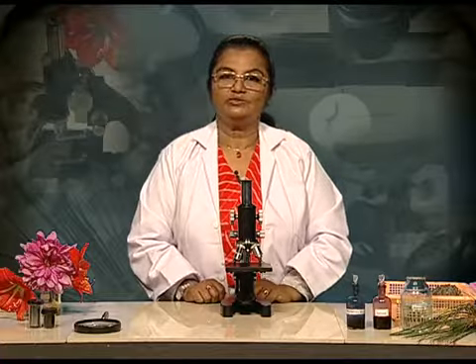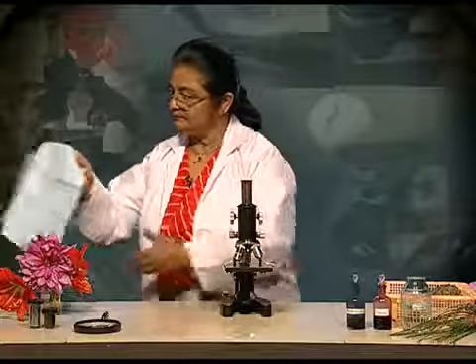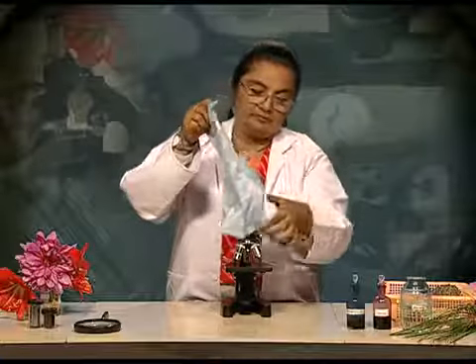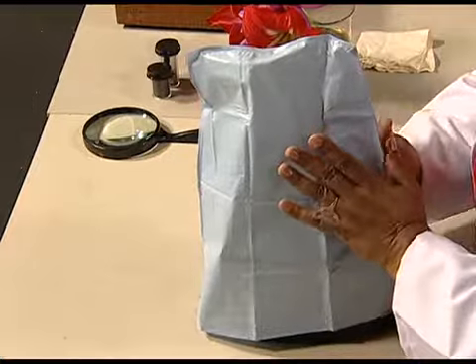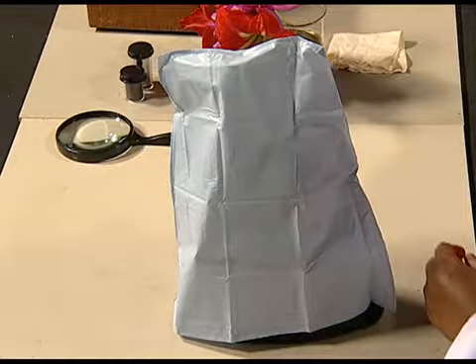Always store the microscope in a polythene cover, or in its wooden box. Here we have covered it with a polythene cover, but there is also a wooden box.